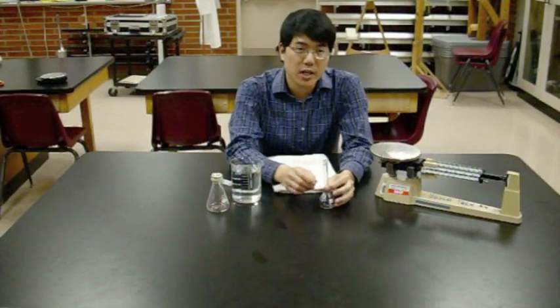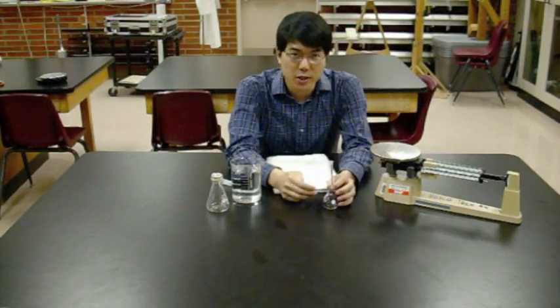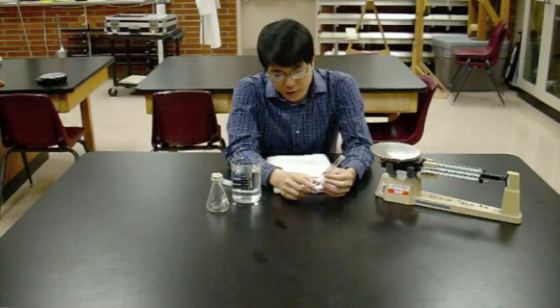Incidentally, a very common question on AP exams is, you know, what devices are good for measuring, are most accurate for measuring volume. Well, I'll tell you right now. There's three accurate ways to measure volume in an AP chemistry lab. One of them is a volumetric flask like you're using now.